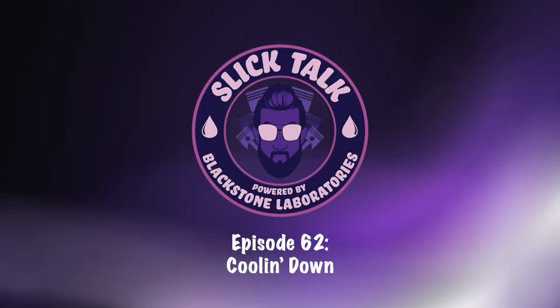So, in order to illustrate our testing and what sort of things can go wrong with coolant, I brought with me a few, I would say, interesting examples that spotlight typical issues as well as an instance where everything looks good. So you have an idea of what an ideal sample of coolant will look like when it's made the rounds. First up, I have a sample where we immediately started the comment with the coolant should not be in use.